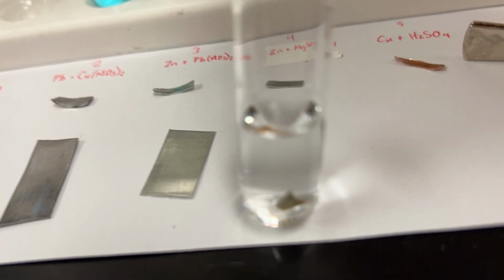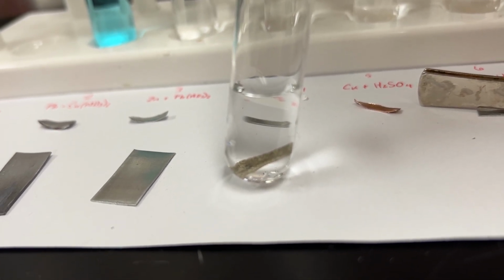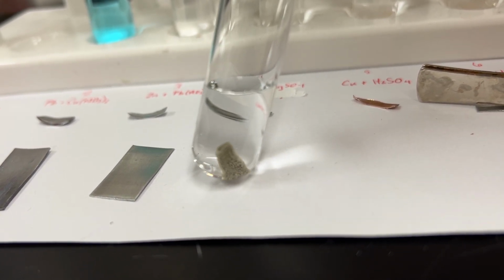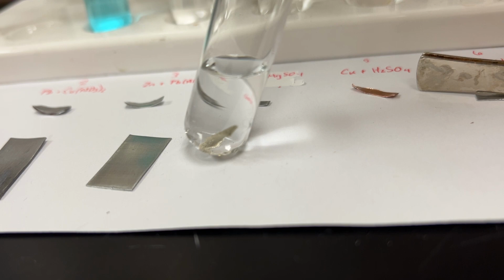And maybe if I get closer, it is very difficult for the camera to focus. You can see that the copper is starting to get coated with something. There's definitely something happening. That copper is starting to get coated with something.